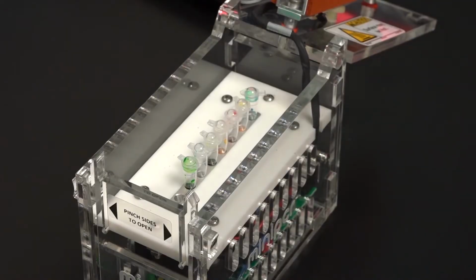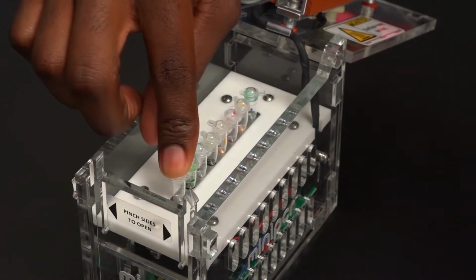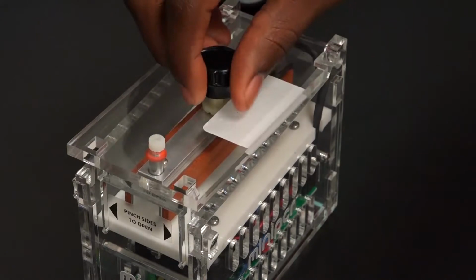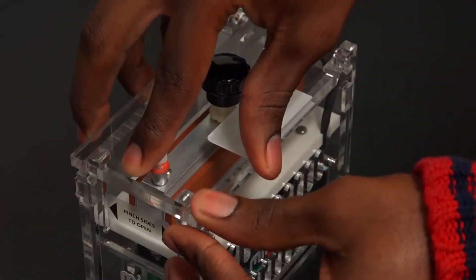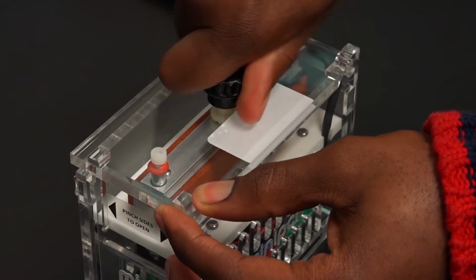Okay, so this little box can take a small sample of DNA and make copies. As many copies as someone might need. But it helps you in a variety of things. It could be used for paternity testing. It could be used in forensics. It could be used for personalized medicine. Think about archaeology, right? If we unearthed a lot of specimens, we could compare the familial relationships there, maybe build a pedigree, or maybe identify that they're not actually related at all. So you can use it in a lot of areas.